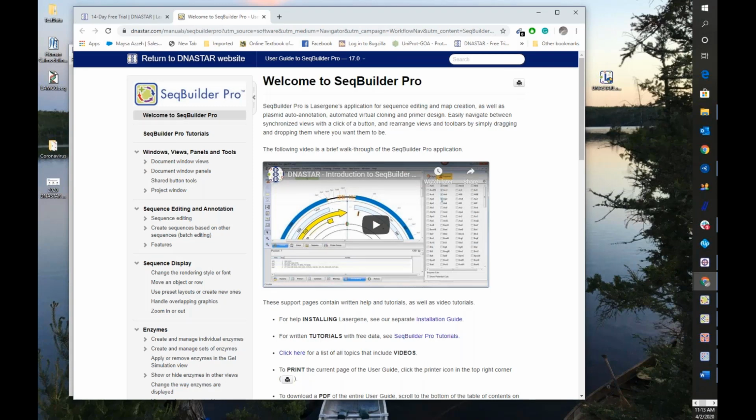Maybe there's a specific parameter in the software that you want more information about, or maybe you're new to SeqBuilder Pro and you want a basic introduction to the software. There are videos and tutorials, and Sharon will go over this later in the webinar in regards to how to make the most of this online resource.